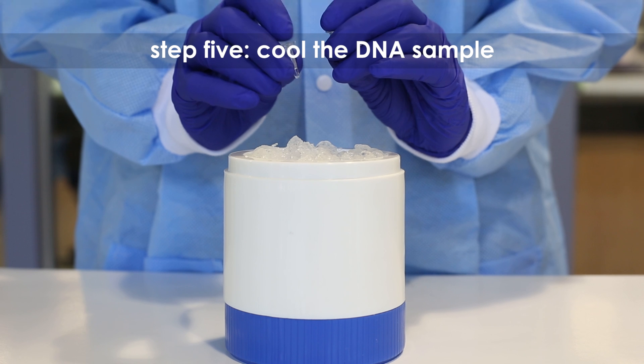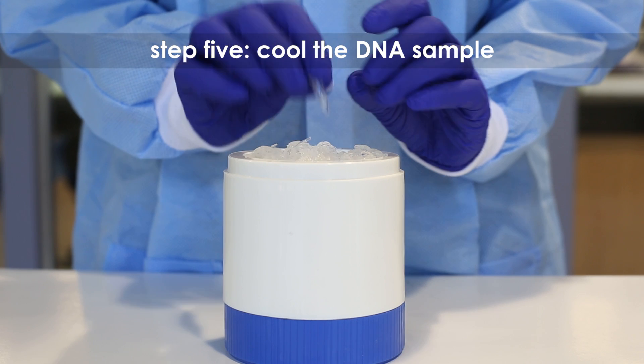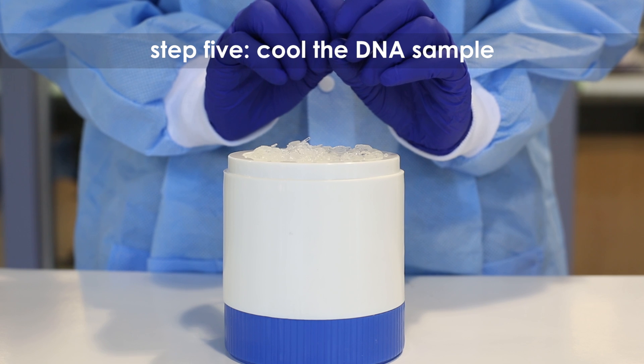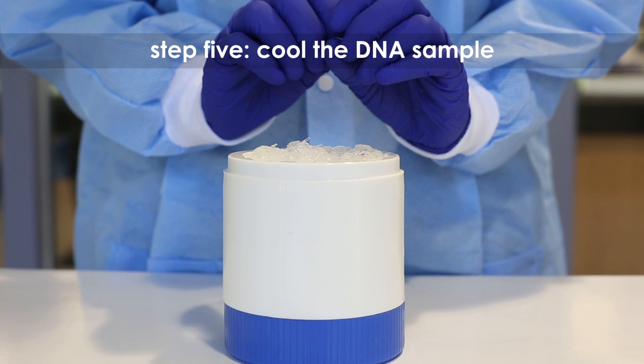Step 5: Place the tubes on ice for cooling. Step 6: You have now finished PCR and may proceed to restriction enzyme digestion or electrophoresis.